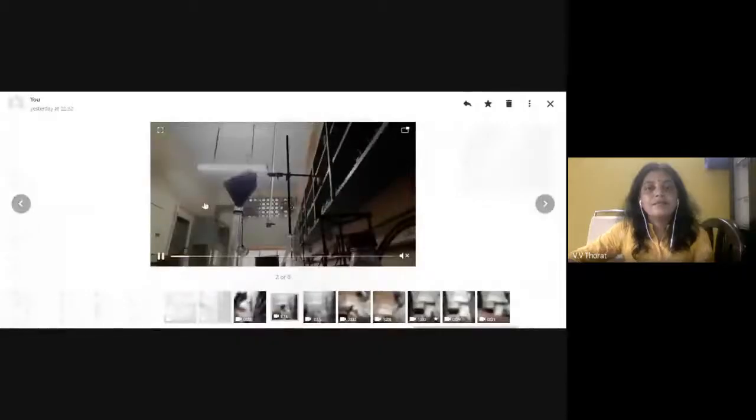Yeah, so we were here. See, we are filtering all the washing into a 100 ml standard flask. Ma'am, the screen is not visible. We were here, right? So I had transferred every solution. Is my screen visible now? Yes, ma'am. I had closed the other gadget, so I am not able to track it.